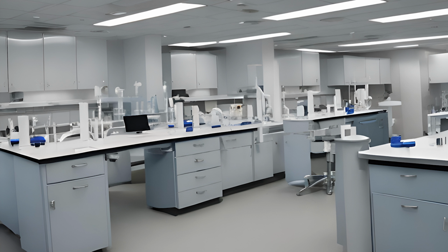Your lab will also have an exposure plan, which will develop, implement, and ensure the protection of your lab's workers against potential exposure to a bloodborne pathogen. This is enforced by OSHA.